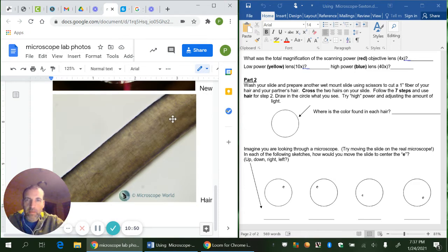It's like transparent. The crazy thing is that if someone has dyed hair, or say if this person whose hair we're looking at in this picture had bleached their hair, that bleach or dye only shows up on the outside. So if this person had bleached their hair, the inside would still be kind of darker colored. If you had light hair and you dyed it darker, the dark color would be only on the outside of your hair.